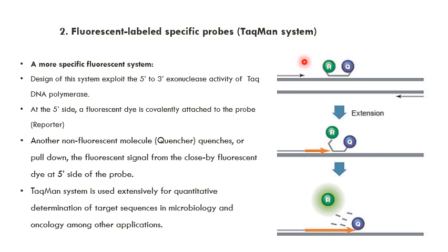Once the polymerase reaches the reporter, it will be cleaved and reported as a signal. This is mainly used in quantitative PCR, microbiology and oncology, among others.